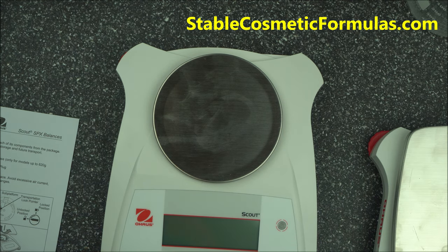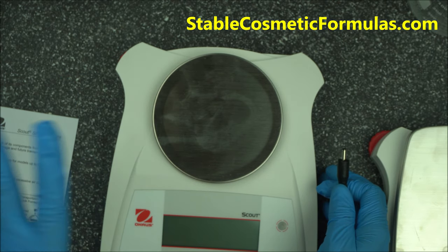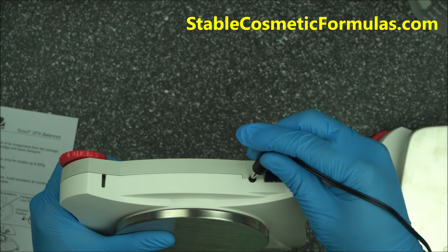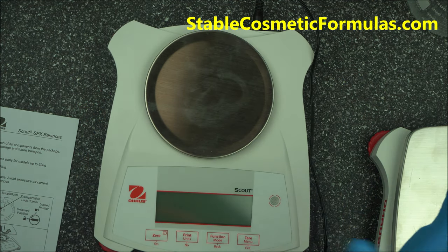Now take the charger that comes with it. Please do not use a battery — I recommend going with the AC adapter. Plug it in and set it on. Now let's talk about how to calibrate it.